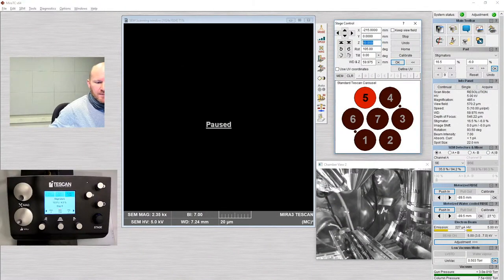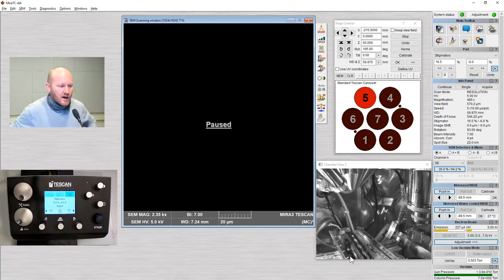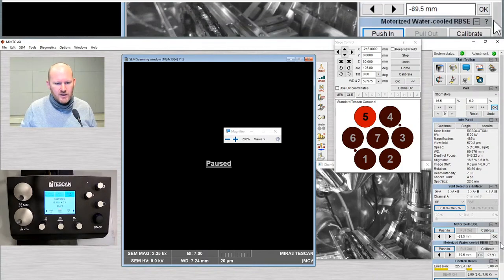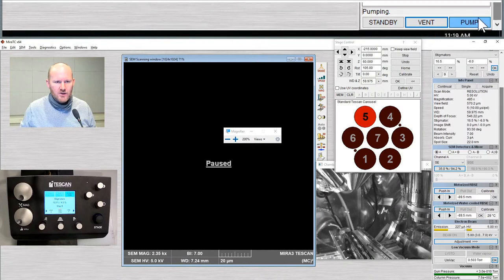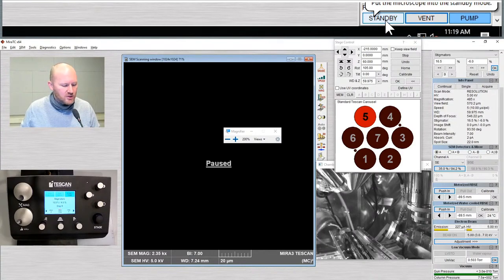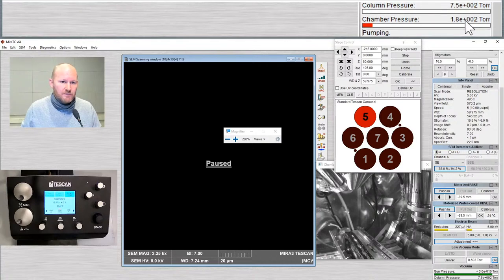I will now close the door and click pump. The pump process is going to take about two to three minutes. You can see at the bottom there's a pump and vent button. Standby is one you do not want to click — that's generally for staff and supervisors as a way to idle the microscope for long periods. So your buttons will be pump and vent. We've vented to load the sample and now we're pumping down. You can see a readout of the chamber pressure — this red bar will progress towards the right and eventually turn green. Once it's green, we can begin operation.